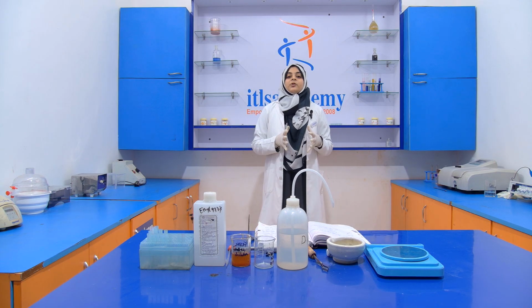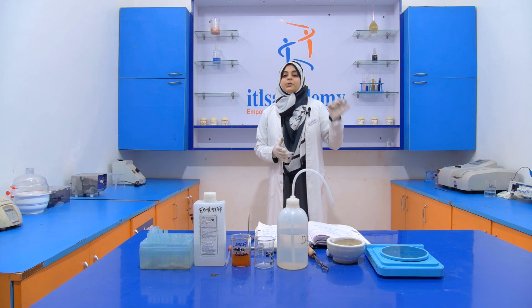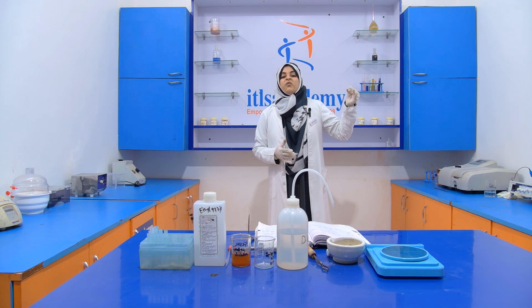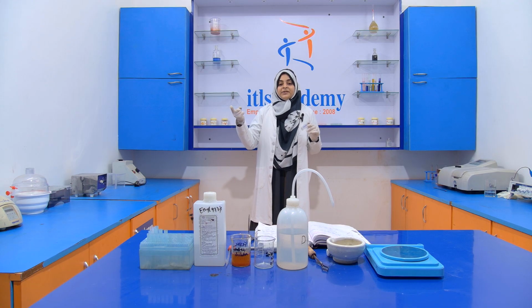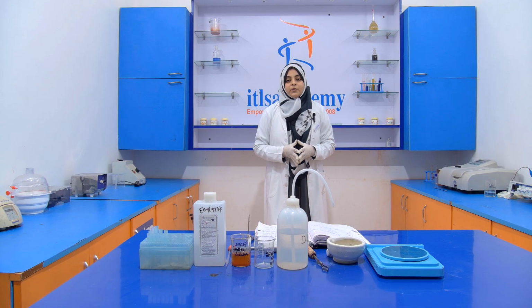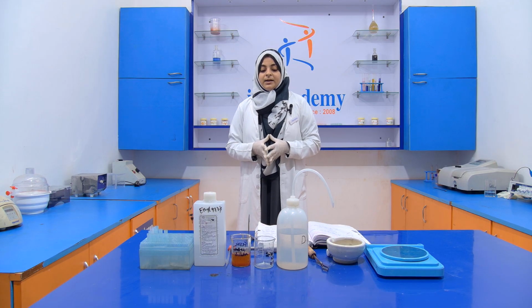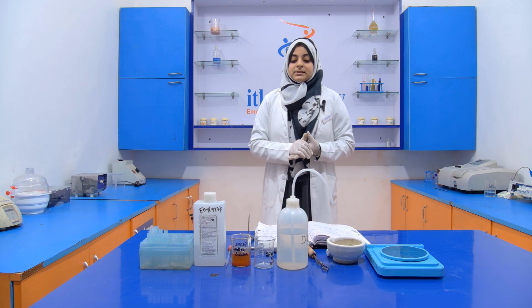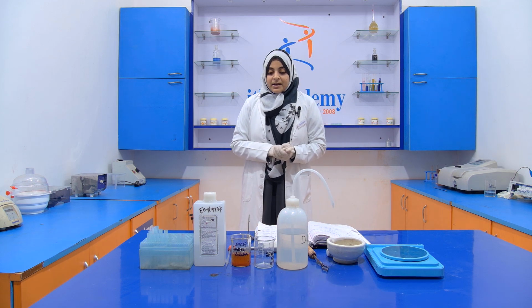Suppose that you pay for 300 gram of black pepper, but in the 300 gram there is 50 gram of papaya seed added. So you pay for 300 gram, but you get black pepper of only 250 gram. The consumer has a loss for this. Even the nutritional value decreases, and some health issues also occur due to the adding of papaya seeds.